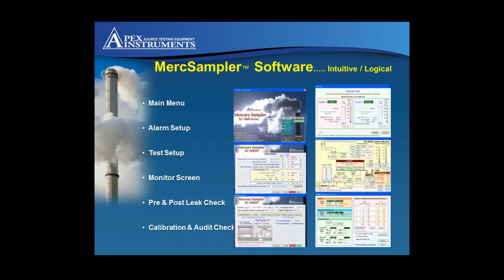And then we also have that last screen there, the calibrations, including the Delta P. That's just a snapshot of calibration screen 2, where you can actually tweak your heater profiles. We have standard heater probes that we use currently, a 6, a 9, and a 12. But we also can do custom lengths.